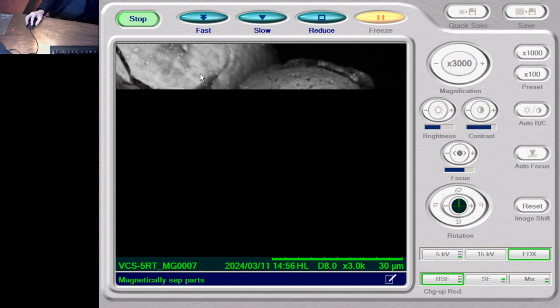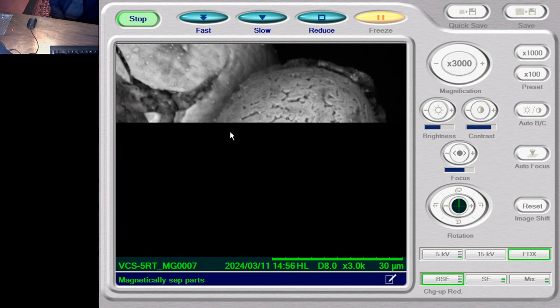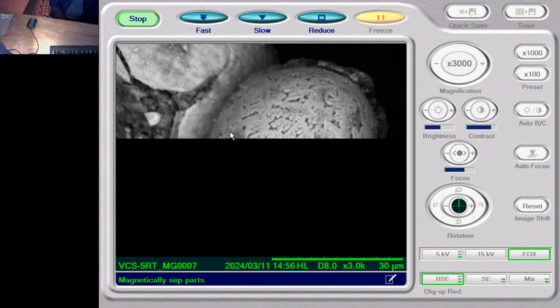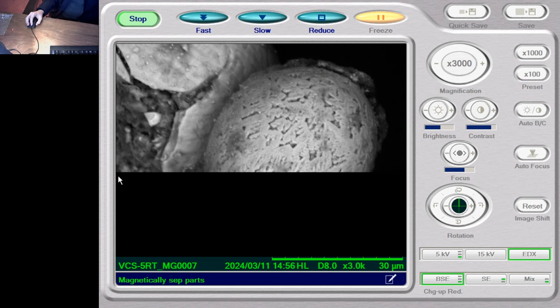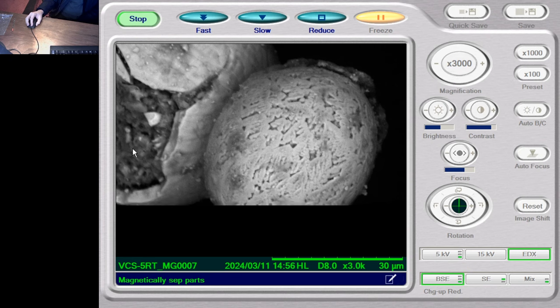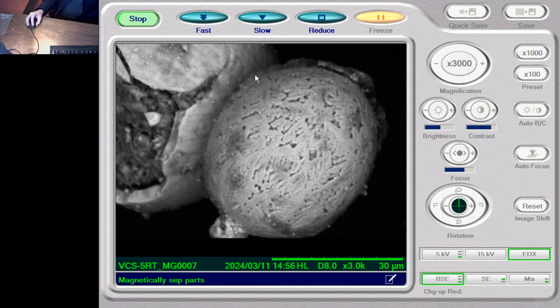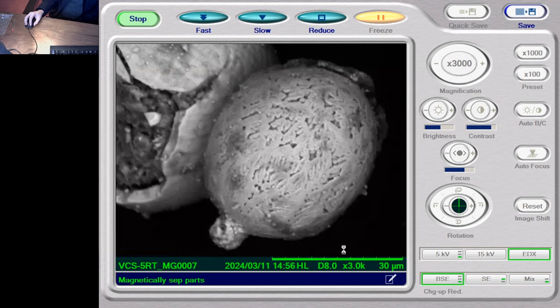And this one over here, you can definitely see the crenellations in that. And normally the crenellations are a layer and then it has a coherent layer on the inside. This one's cracked and then filled up with rubbish. Yeah, definitely you've got some skim around the outside. It might be difficult to capture it on this one unless we go here. And I expect that to be higher in silicon and carbon. Okay, so we'll take that and we will capture that over here.